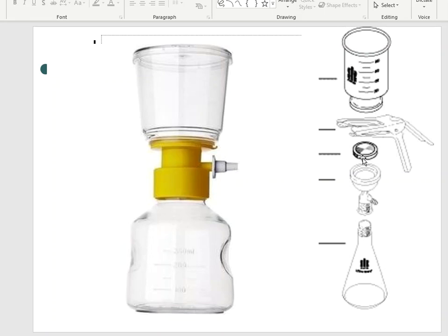As you can see, there's this removable piece in between the two. The top sits down onto the bottom, and this clamp holds those two pieces together. In the middle, you'll have this wire grid or mesh. This wire mesh is the support that you will need to put your plasticky membrane filter on, because it does look like a piece of flexible plastic in a way. It'll feel very smooth and very flexible. So this wire mesh grid will be the support. You'll put your membrane filter on top of that, then the top sits down on it, the bottom sits underneath it, and this clamp will hold all of those pieces together.